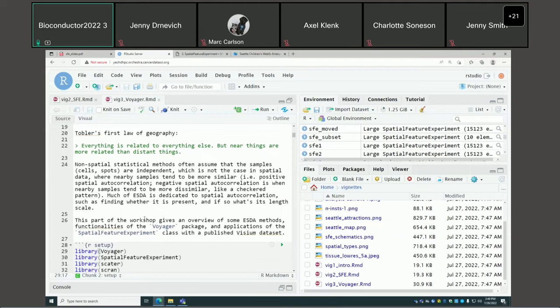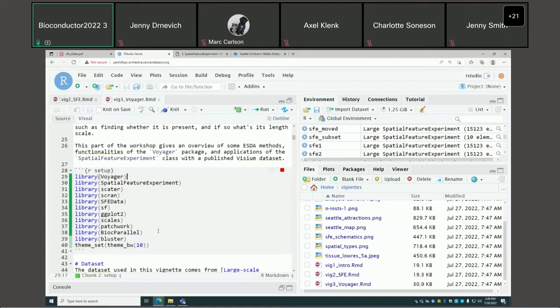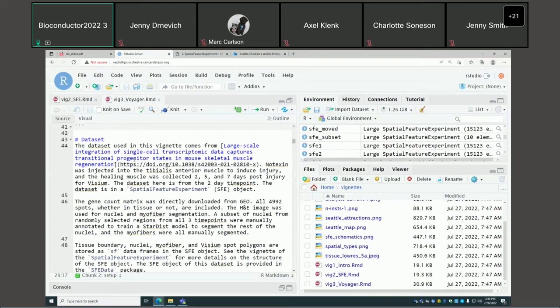We use the SF and SPDEP packages to explore spatial autocorrelation. We'll load the packages. This dataset is already published and comes from mouse skeletal muscle, specifically collected two days after notexin injury.